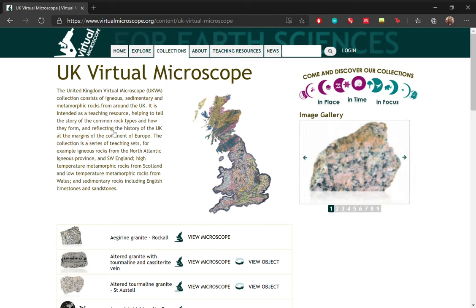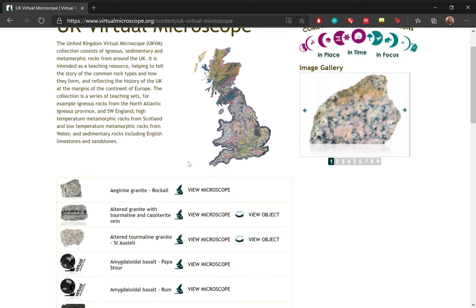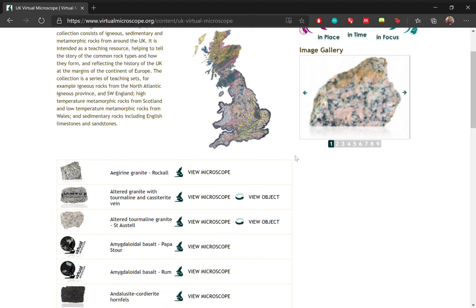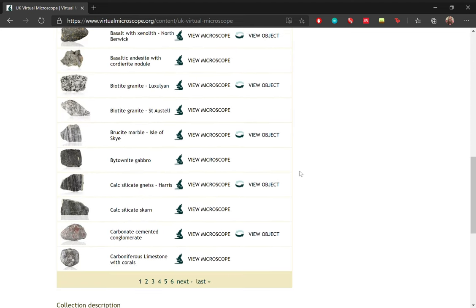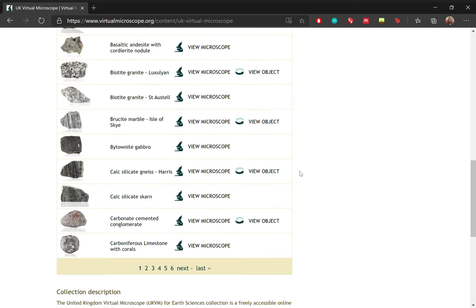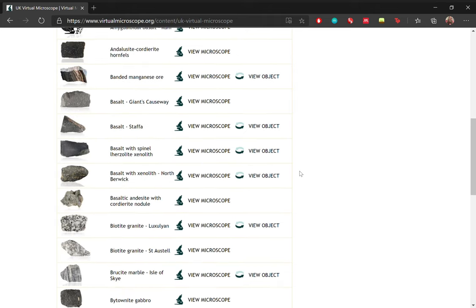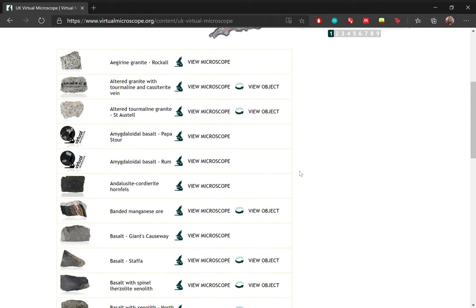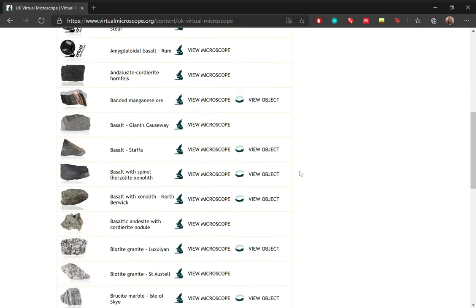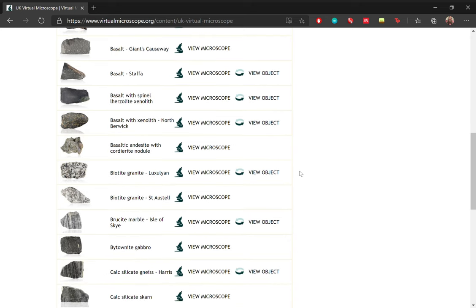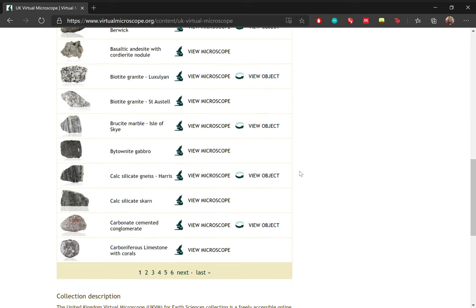Okay, so here is the page that you will get. The UK virtual microscope consists of igneous, sedimentary, and metamorphic rocks that have been collected around the UK. So if you look here, we have a list of approximately six pages of rock samples. And because my lecture recently has been on the introduction to metamorphic rocks, let's have a look at examples that are related to metamorphic processes. So we have a calc silicate gneiss. Let's have a look at this one.